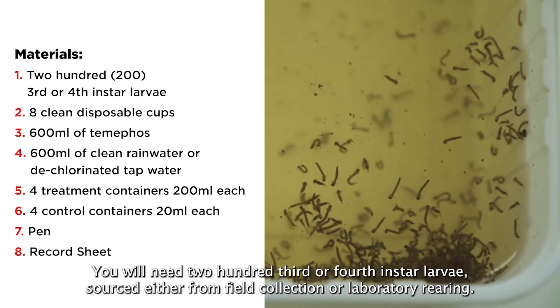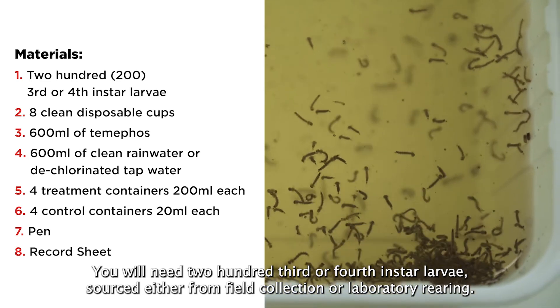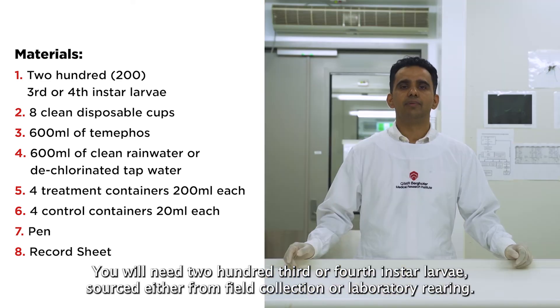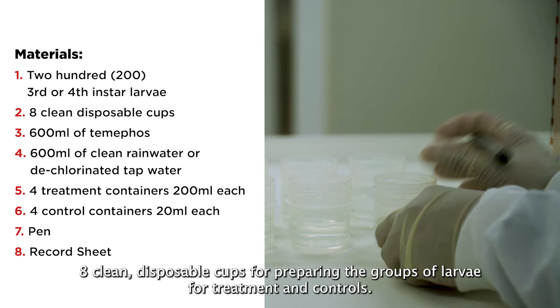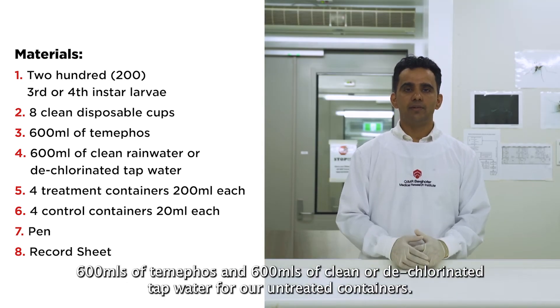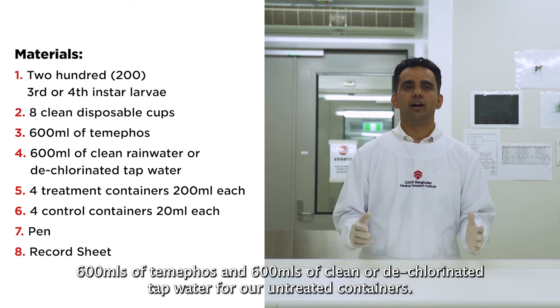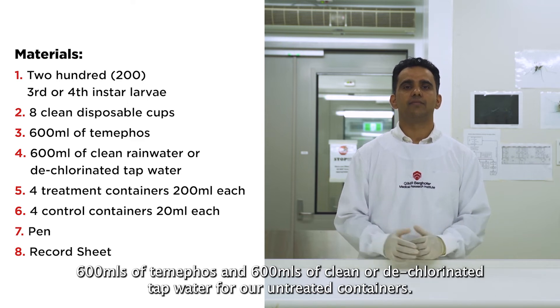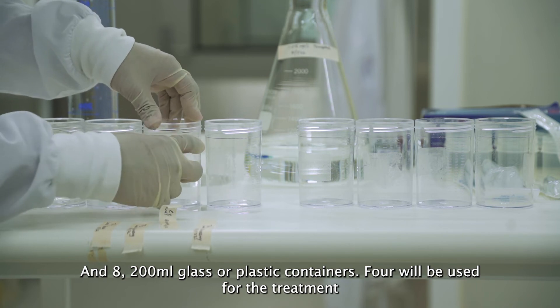You will need 200 third or fourth instar larvae, sourced either from field collection or laboratory rearing. Eight clean disposable cups for preparing the groups of larvae for treatment and controls. 600 ml of Temephos and 600 ml of clean or dechlorinated tap water for our untreated containers.